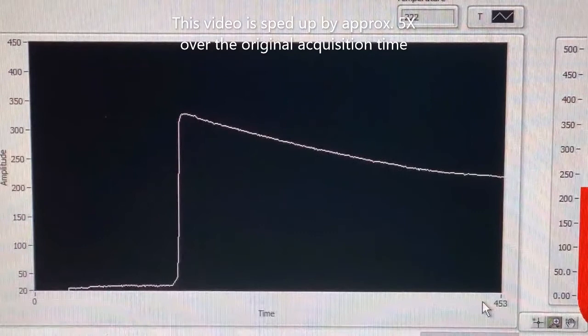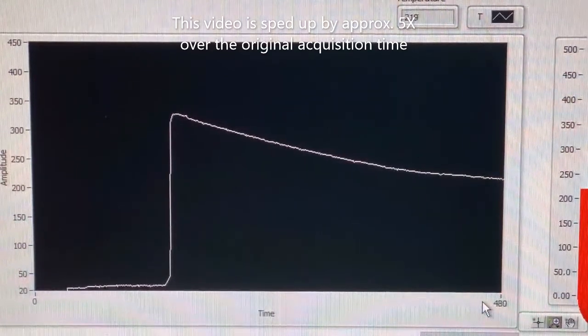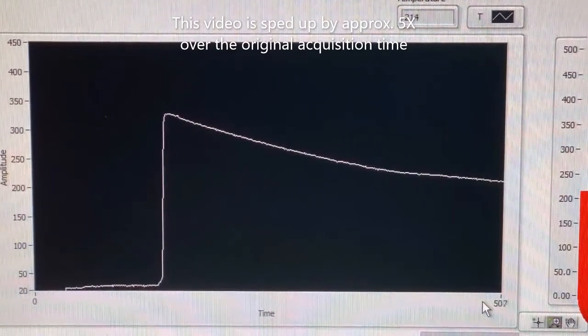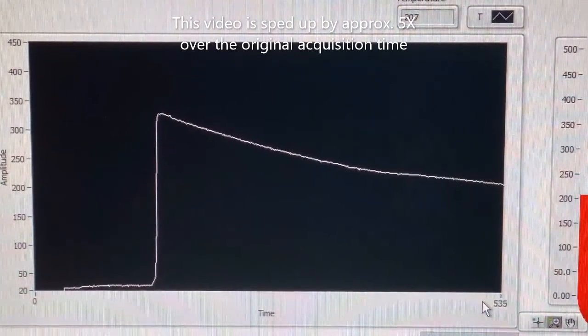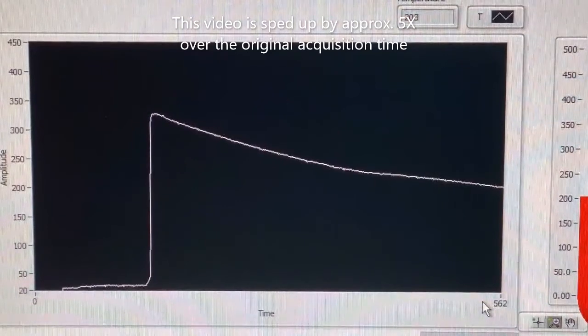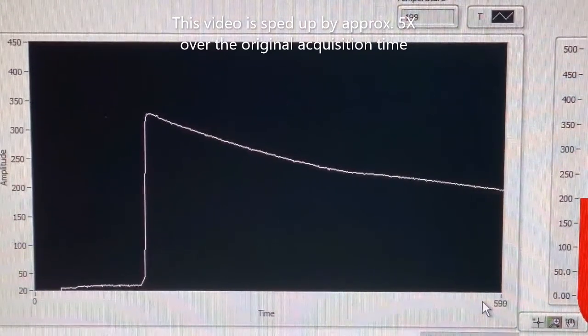As you will note, the temperature shown in the top of the screen in the small box continuously decreases. You should note at this stage that the slope of the curve is starting to change. It's becoming more horizontal, but again not an isotherm. The temperature does keep dropping in the window at the top.